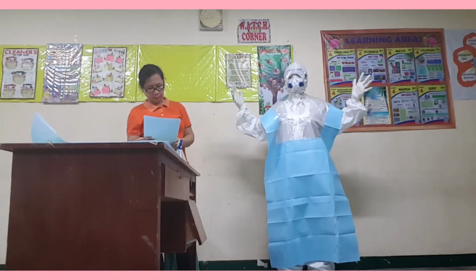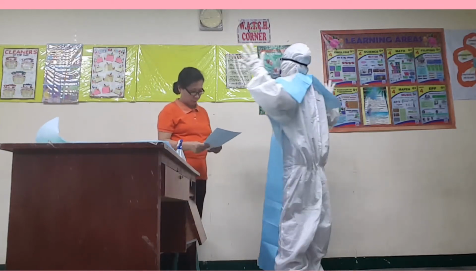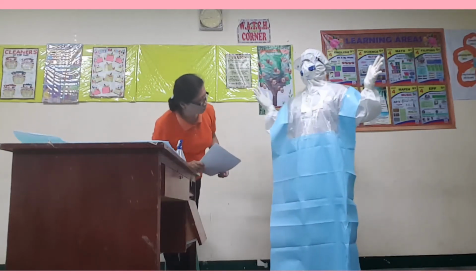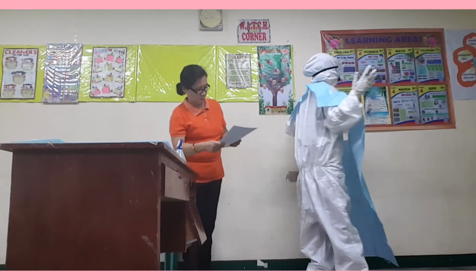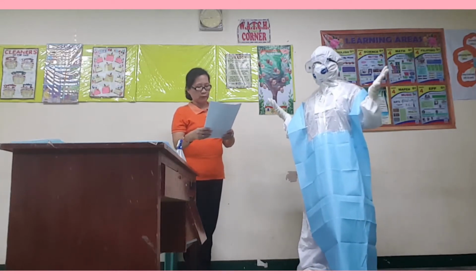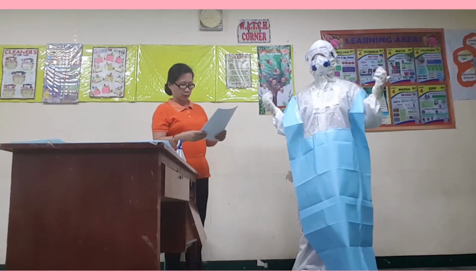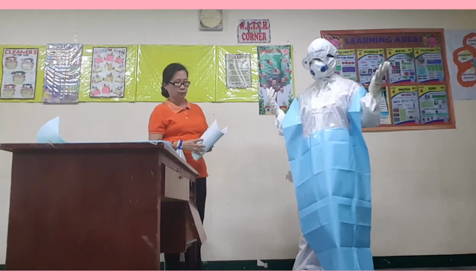Procedure number 1. Inspect the PPE to assess for visible contamination, cuts or tears before starting to remove. For any visible contamination, use 1:10 bleach disinfectant to wipe it off. This is to make sure that the medical workers are safe from contamination risks.